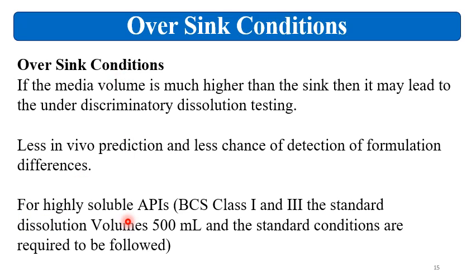For highly soluble APIs like BCS class 1 and 3, though these APIs are highly soluble and very little media may be required, still the dissolution volume of 500 ml can be taken and the standard dissolution conditions can be used for dissolution testing.